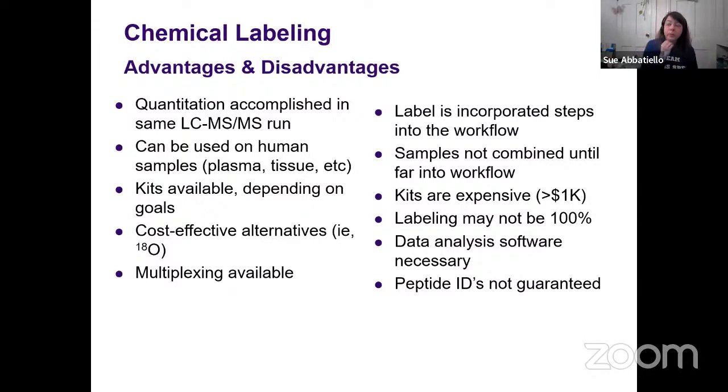What top N you pick depends on your chromatogram, your peak width, and being able to sample as many of the chromatographic peaks as you can without oversampling, meaning measuring the same one over and over again, or undersampling and skipping ones that are maybe not intense enough. Does that answer that, hopefully?